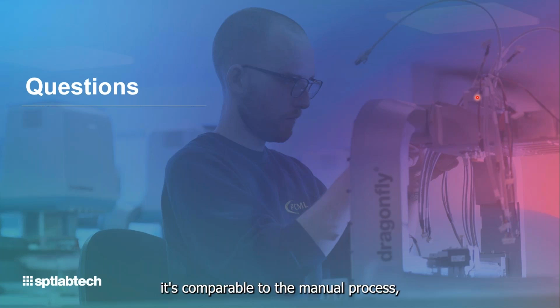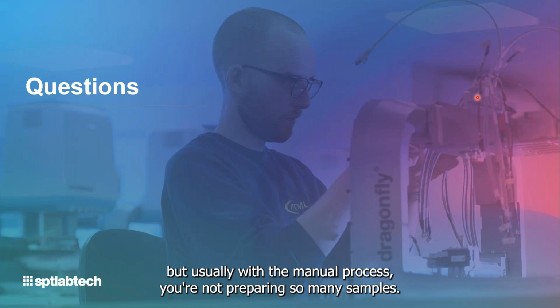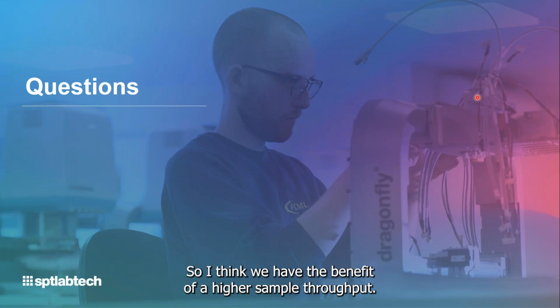So in the region of 5 hours, which I think is comparable to the manual process, but usually with the manual process, you're not preparing so many samples. So I think we have the benefit of higher sample throughput.